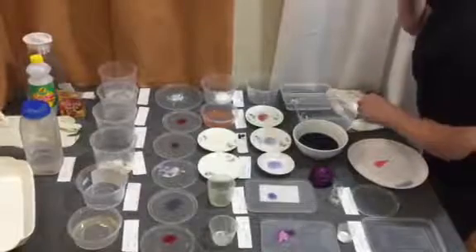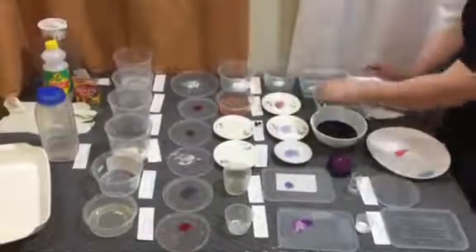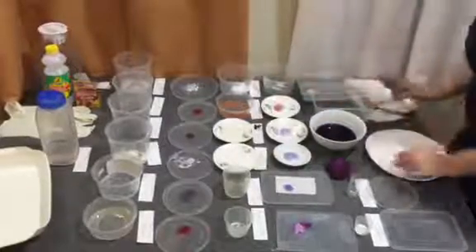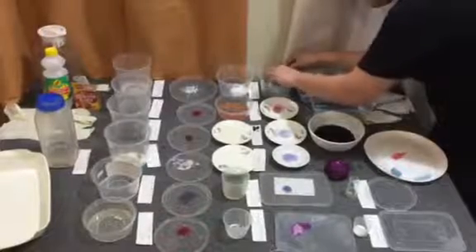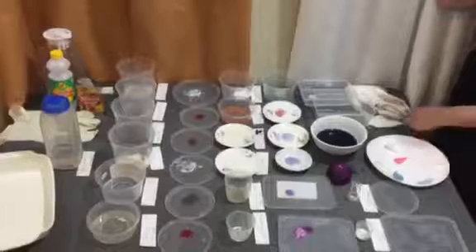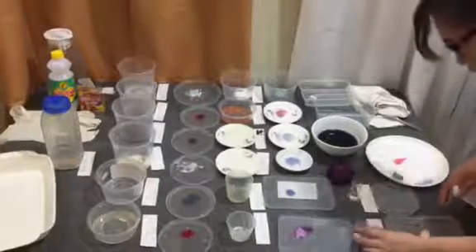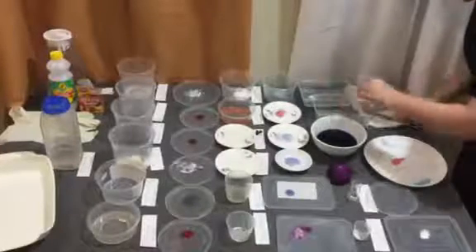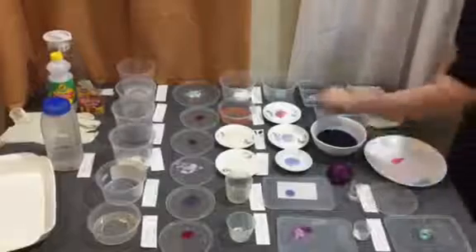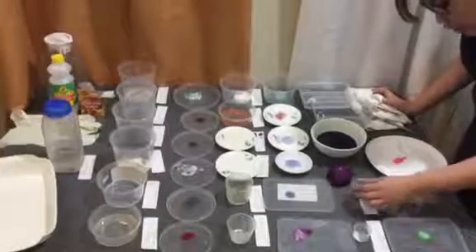Next, baking soda. Next, detergent. And then bleach.